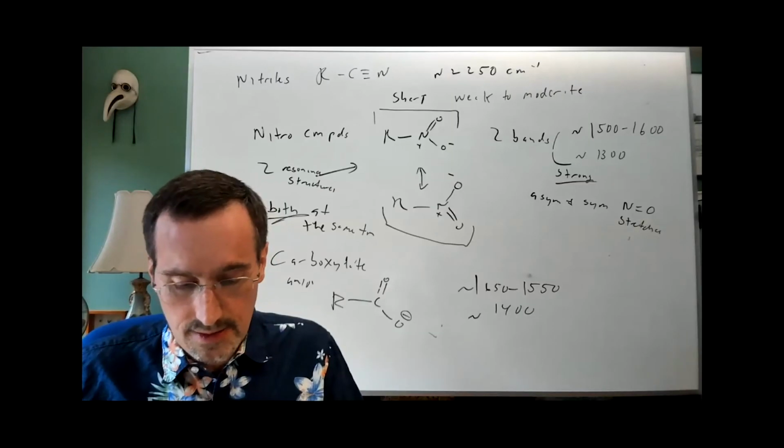I have a question. You said it's symmetric and asymmetric, kind of akin to the CH2s, right? Yep. CH2s don't have resonance, and this one does. And because these are equal in resonance, I thought they would not have any symmetric or asymmetric one.